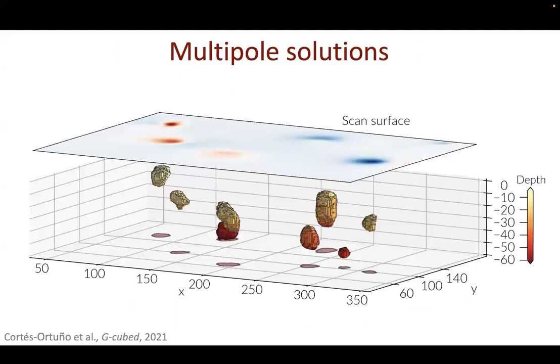Until then, we were used to fitting dipoles, because that's what we generally think of. So we have a grain, and if we are far enough away, then that signal becomes fully dipolar. But the QDM, by its nature, is really close by. So you see these expressions of vortex states or multi-domain grains. So you cannot just easily fit a dipole without underfitting your data. David, my postdoc, was working on an inversion routine anyway. So he said, well, then we can try spherical harmonic fitting.